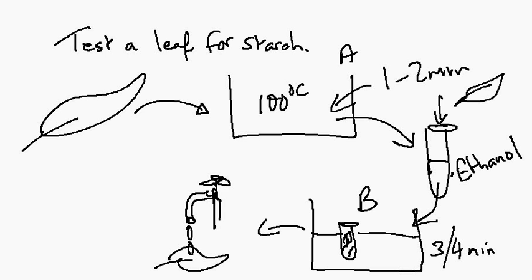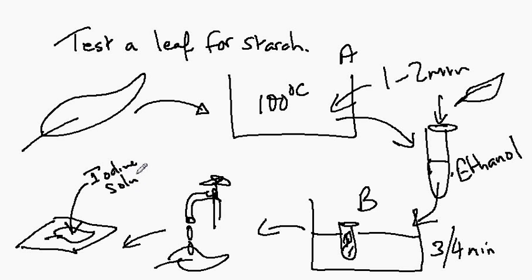Okay, so wash the leaf and then put it onto a white tile. Okay, here's the leaf. It's sitting on the white tile, and I want you to then add iodine solution as a test for starch.